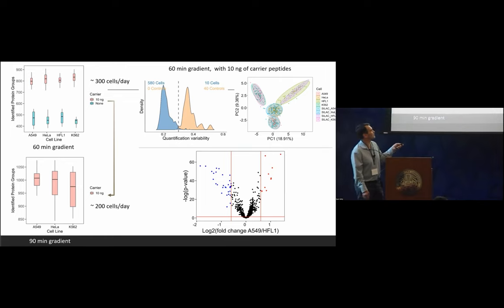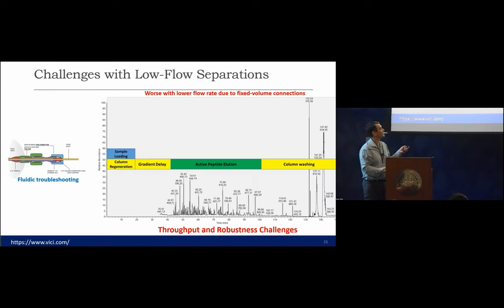But you know, 4 different cell types, we were able to tease those apart, and I think there are 2 issues with this. One is the current built-in software, to make sure that if you pick one precursor, you also grab the heavy version. Grabbing those in pairs is not working well, and I think Chris Rose is developing a better algorithm for that. And then just the slow speed of MS2 is a trade-off, right? Because we now have twice the number of precursors to choose from. But I think that's an issue that's going to be solved with the next generation of instrumentation.